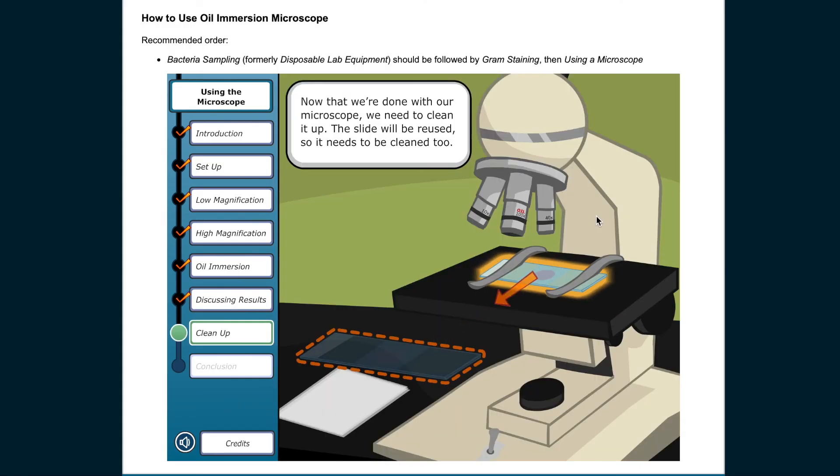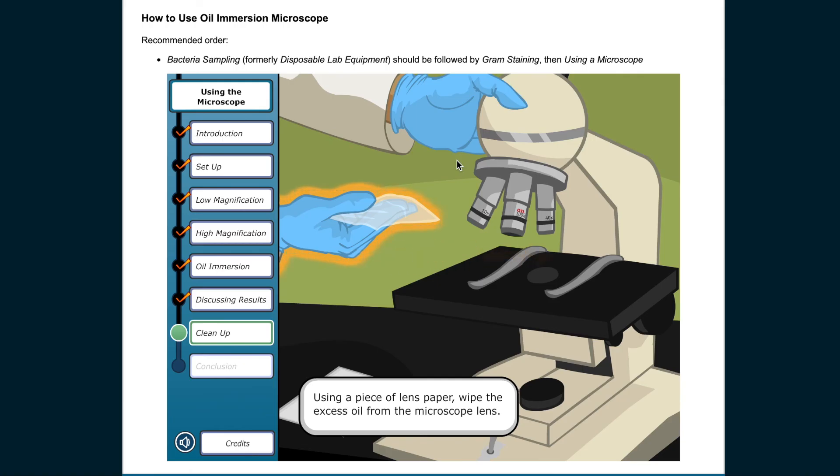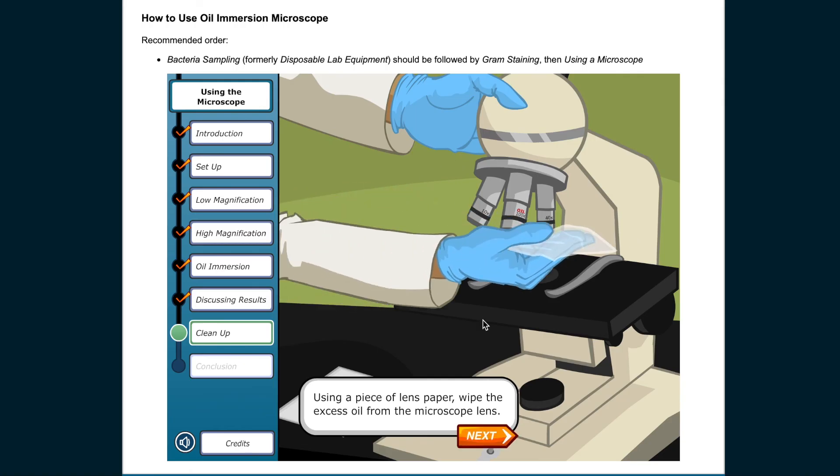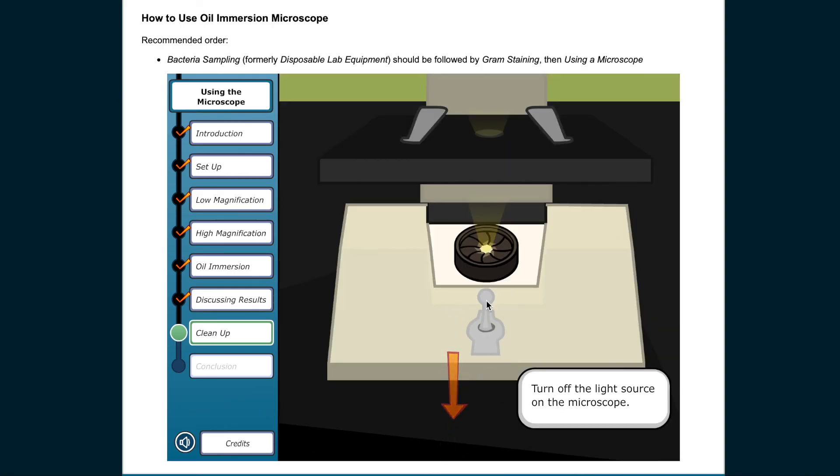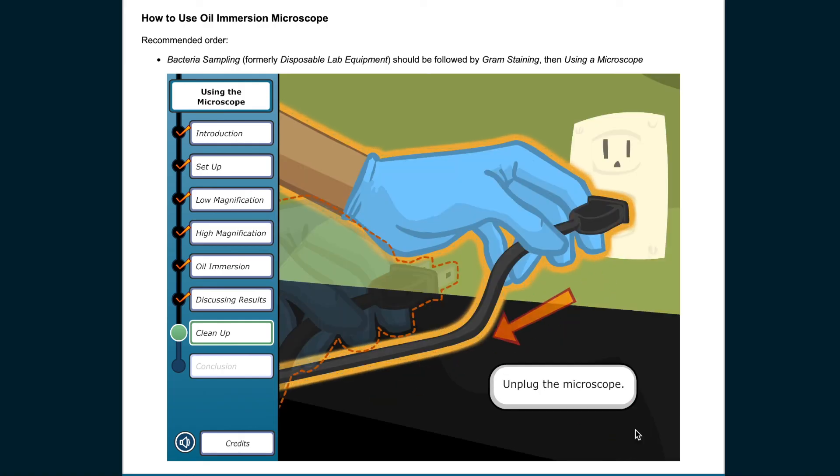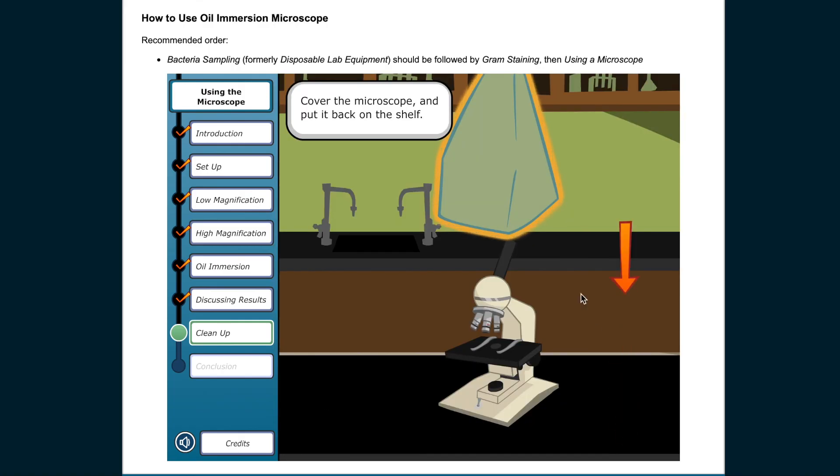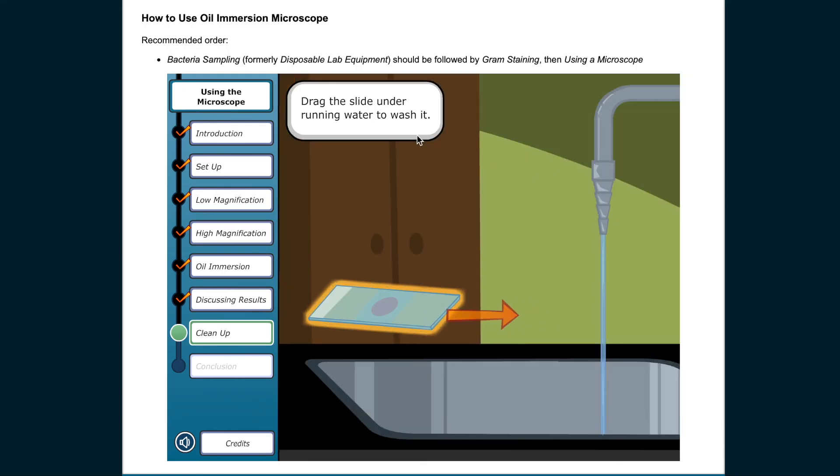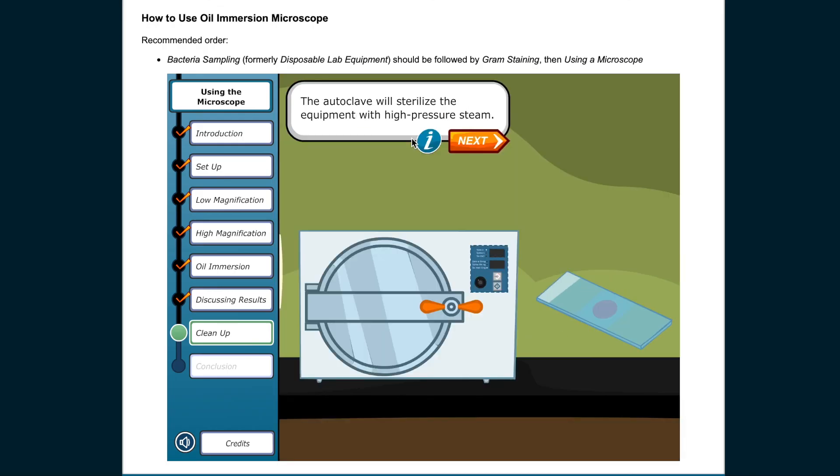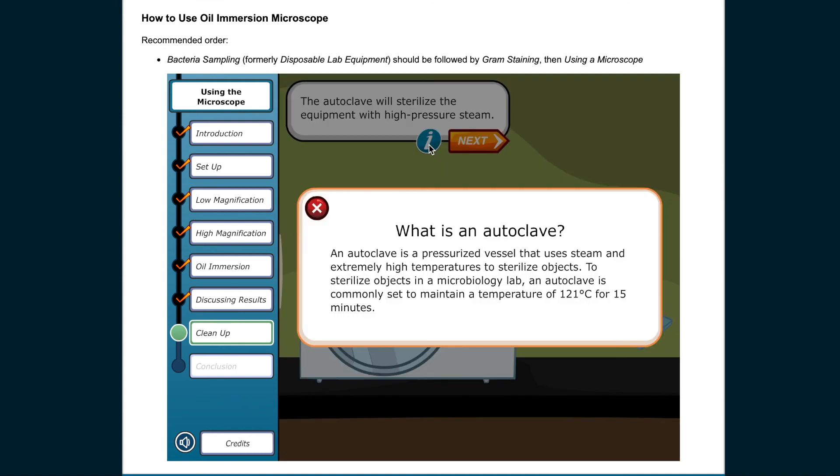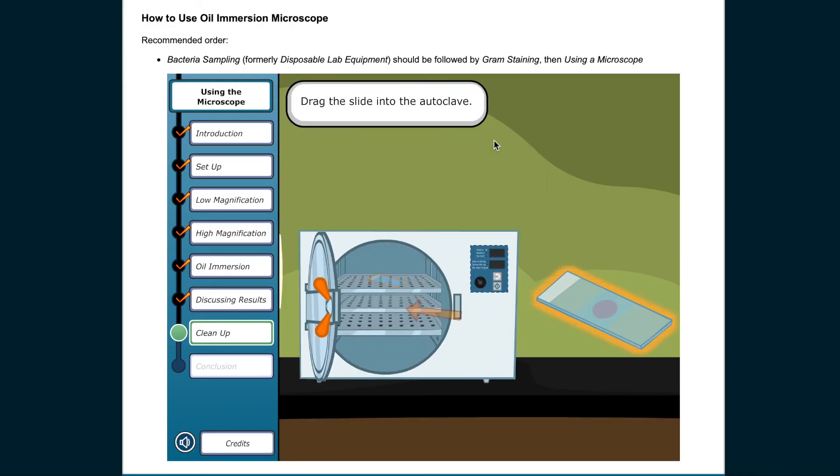Now that we're done with our microscope, we need to clean it up. The slide will be reused, so it needs to be cleaned too. Using a piece of lens paper, wipe the excess oil from the microscope lens. Turn off the light source on the microscope. Unplug the microscope. Cover the microscope and put it back on the shelf. Drag the slide under running water to wash it. The autoclave will sterilize the equipment with high-pressure steam. An autoclave is a pressurized vessel that uses steam and extremely high temperatures to sterilize objects. To sterilize objects in a microbiology lab, an autoclave is commonly set to maintain a temperature of 121 degrees Celsius for 15 minutes.